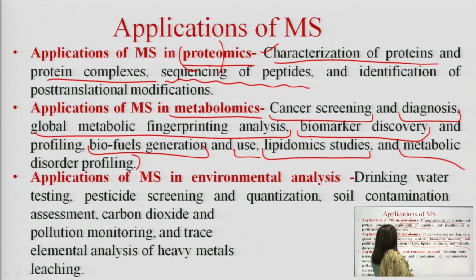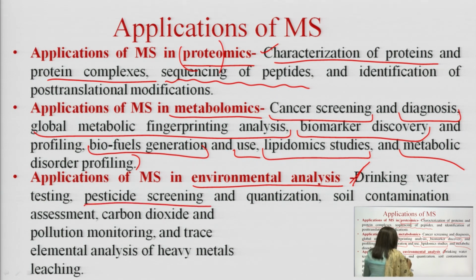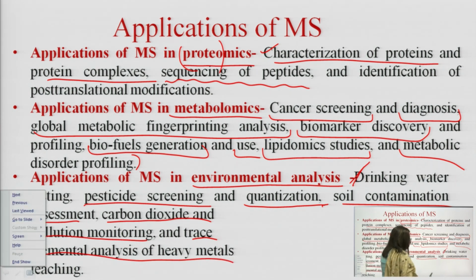In all of these the role of mass spectrometry is immensely important. Then we have the application of MS in environmental analysis, like drinking water testing, pesticide screening and quantitation, soil contamination assessment, carbon dioxide and pollution monitoring, and trace elemental analysis of heavy metal leaching.